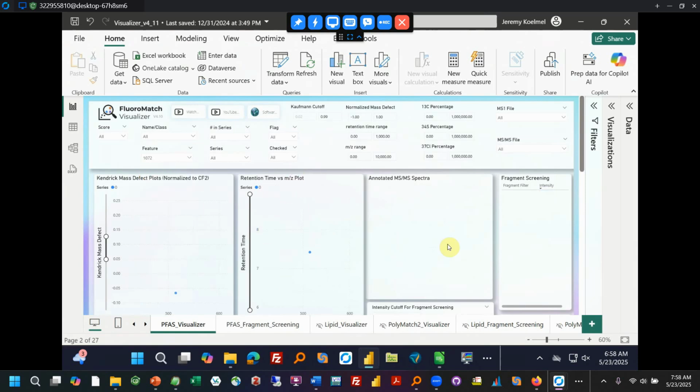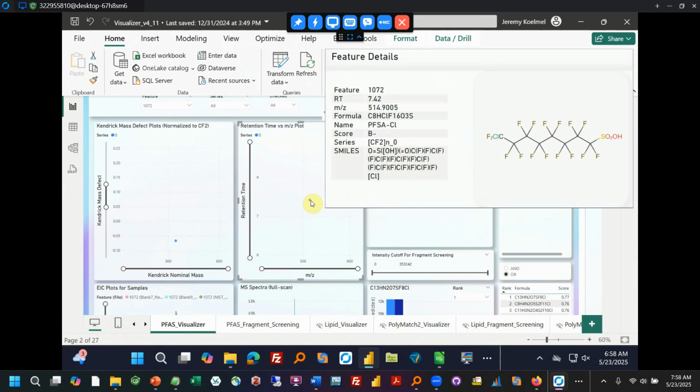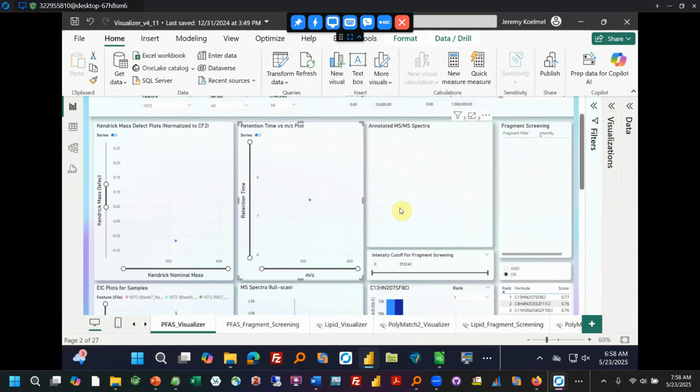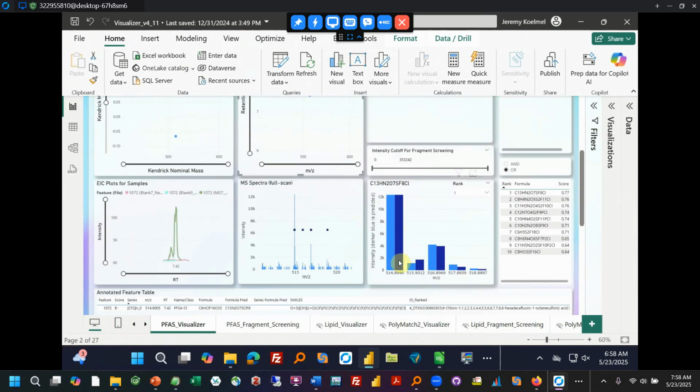So here's the species. No MSMS that we see here. It did get a B minus, and remember that means that it did have MSMS information. But the way that our MSMS spectra are compiled here, and this may change in future versions, is that if there's more than one feature for a specific MSMS spectra, the feature with the closest retention time is assigned that MSMS spectra. So when you have overlapping molecules, we can look at the isotopic pattern.